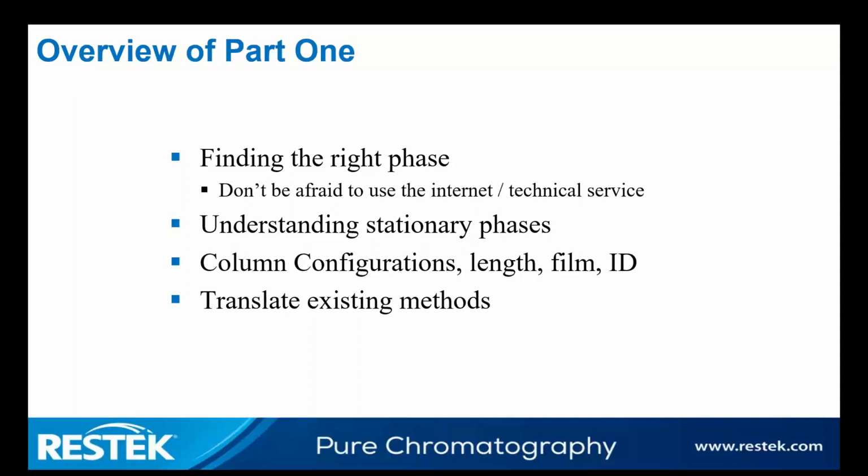Many times we can go on the internet and find something that fits for what we're doing. For instance, if we're looking for 8260, we might run into Amy's application that she's done on there, which has been completely optimized not only for the GC conditions, but also for the purge and trap conditions. And that would be completely appropriate. If we have a smaller list, however, we might want to use a different tool or something else in order to get that separation.